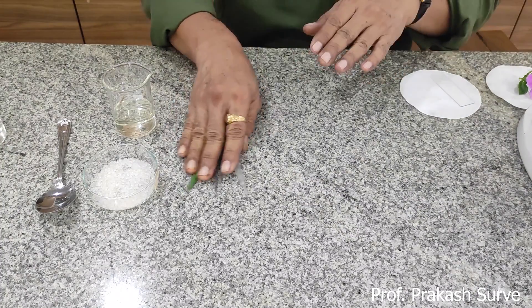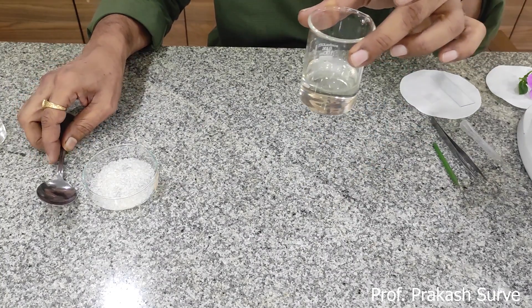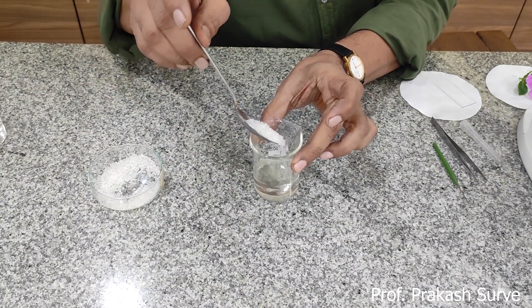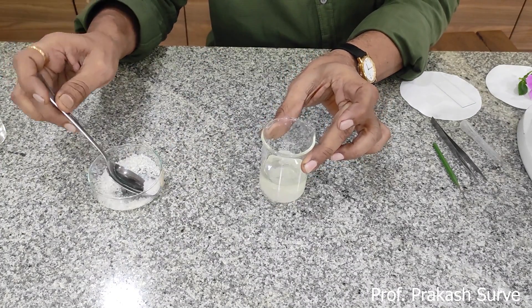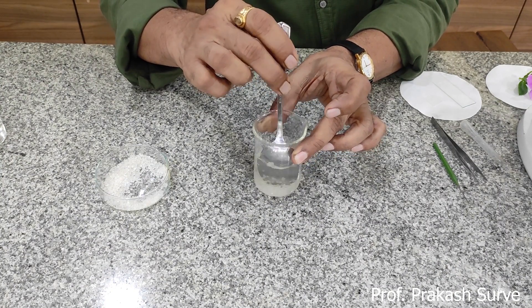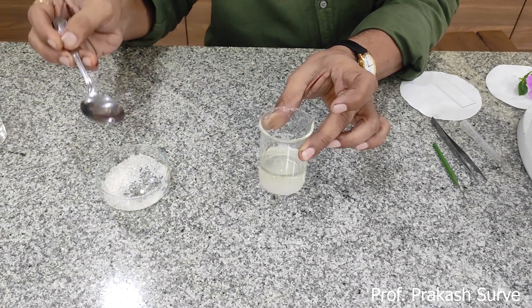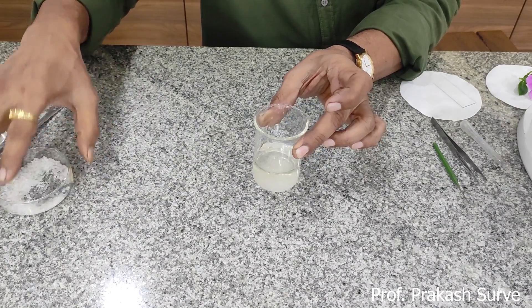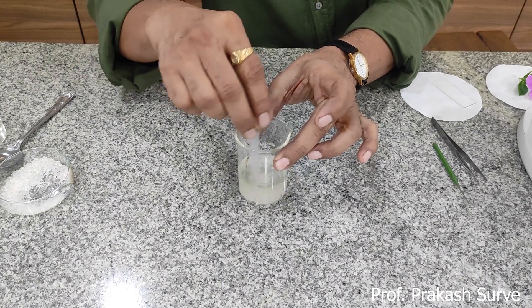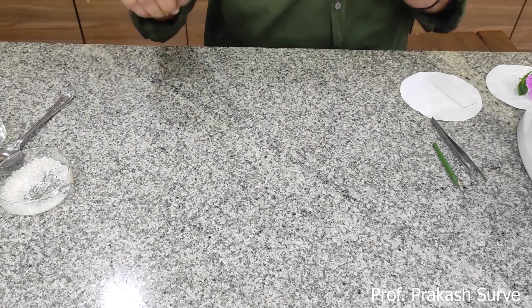We will take approximately half a beaker of water, in which we will add one teaspoon of normal sugar. We have to make a concentrated sugar solution for the pollen tube germination. Stir it well so that all the sugar gets dissolved and then we will get the concentrated sugar solution. Keep this aside.